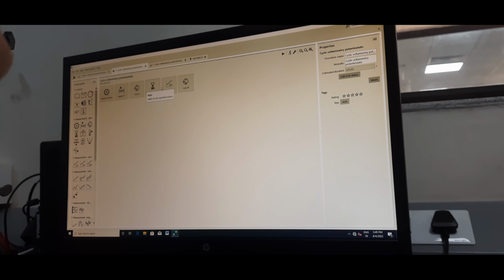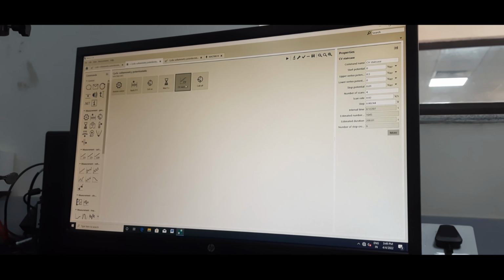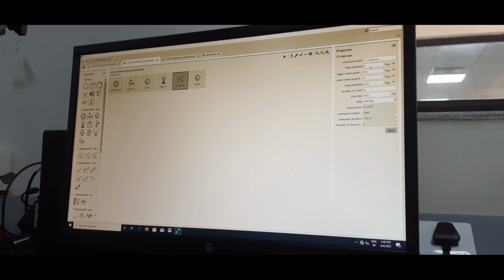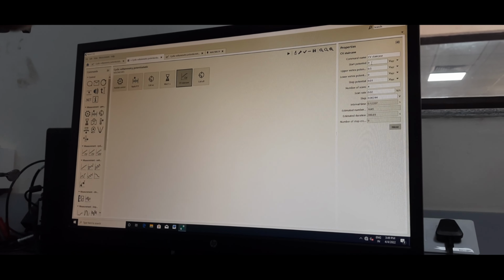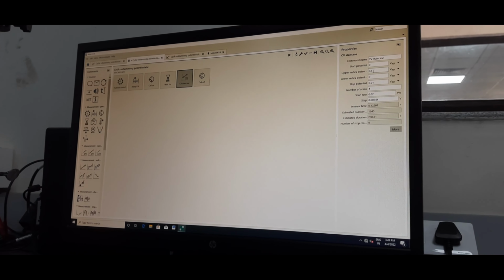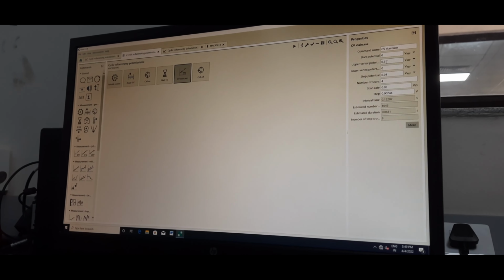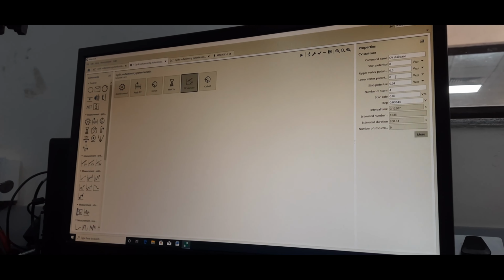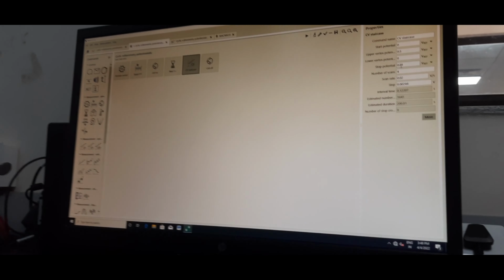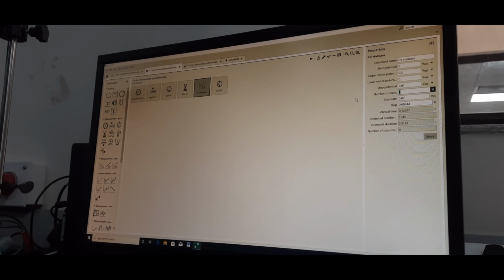Here we are going to do CV staircase, it is written, right? So start potential is 0 volt with respect to reference electrode. Upper vertex we will go from 0 to 0.5 volt. Like in class I have shown you minus 0.1 to 0.8 volt. So here that boundary is 0 to 0.5 volt. Lower vertex is same as 0. Stop potential 0.01.